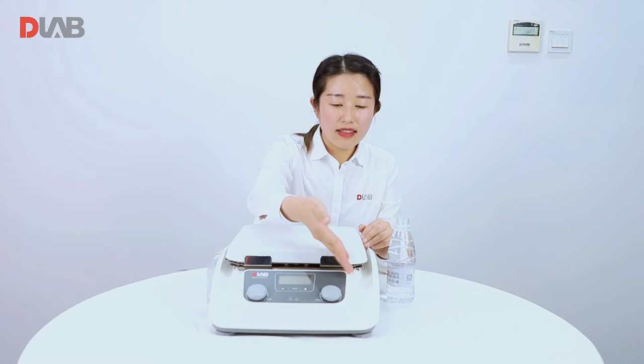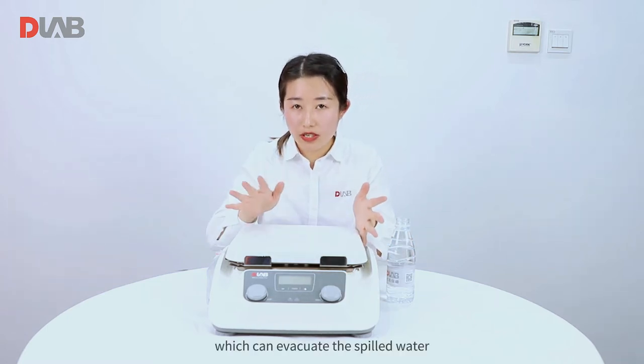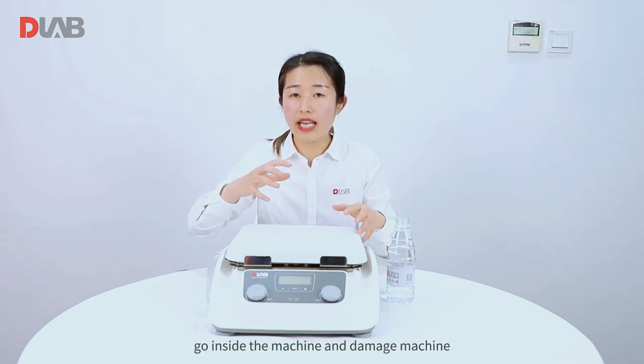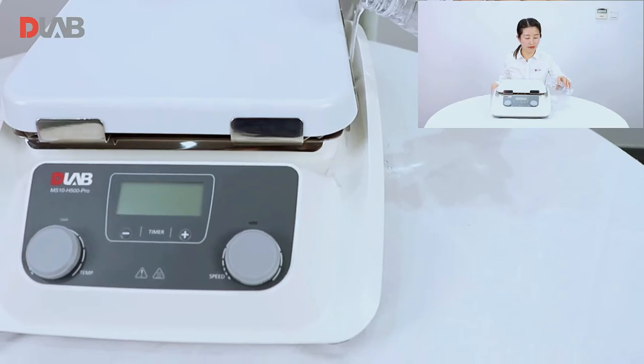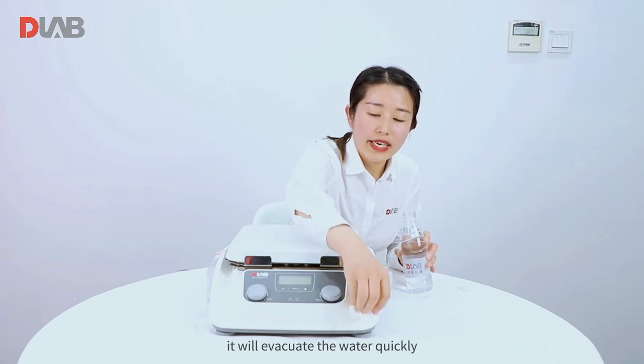You can see here there is a special groove design which can evacuate spilled water quickly and avoid the water going inside the machine and damaging it. Let me show you — it will evacuate the water quickly.